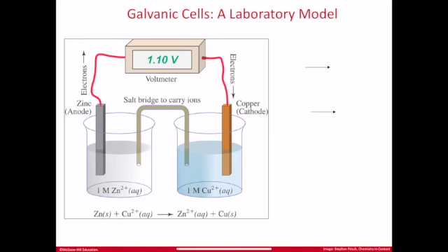So this is an example of what we're going to do in lab in maybe 2 weeks. This is a laboratory electrochemical cell. So electrochemistry, remember, is when you have the process of turning chemical energy into electrical energy.